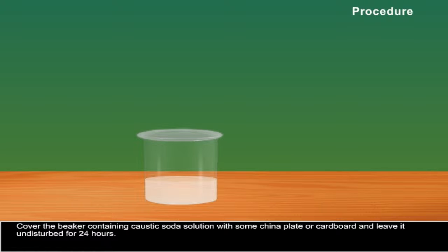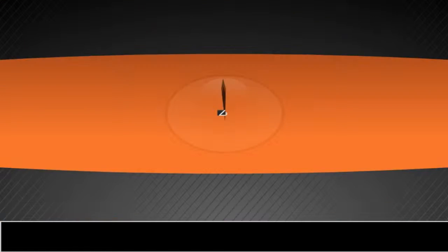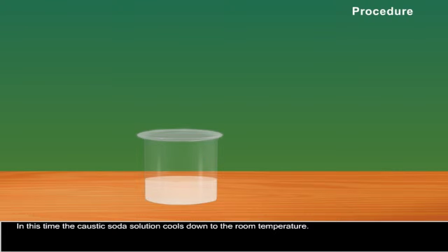Cover the beaker containing the caustic soda solution with some china plate or cardboard and leave it undisturbed for 24 hours. After 24 hours, the caustic soda solution cools down to room temperature.